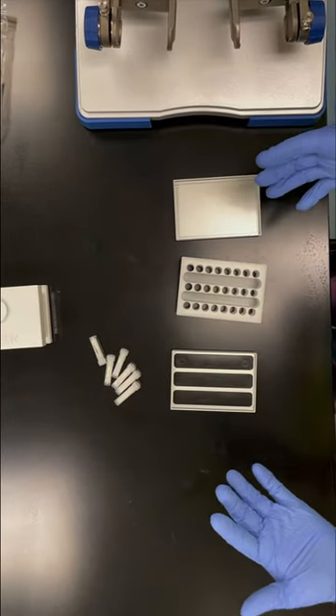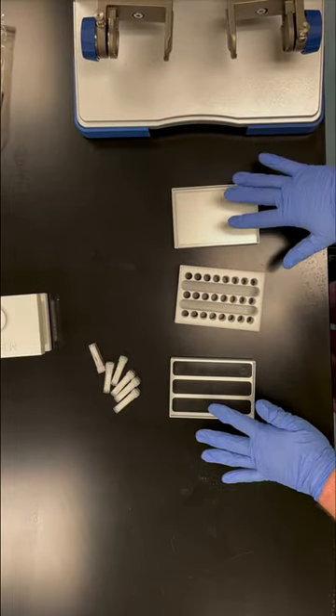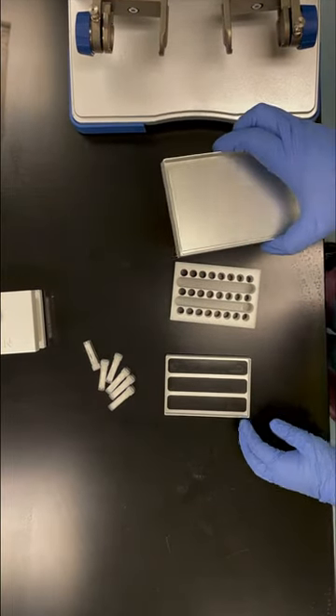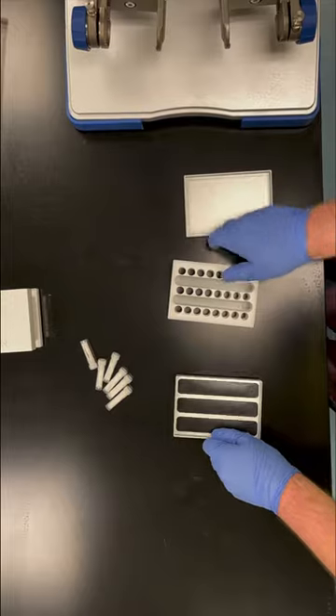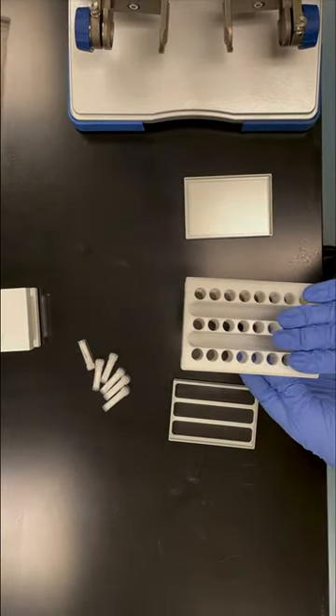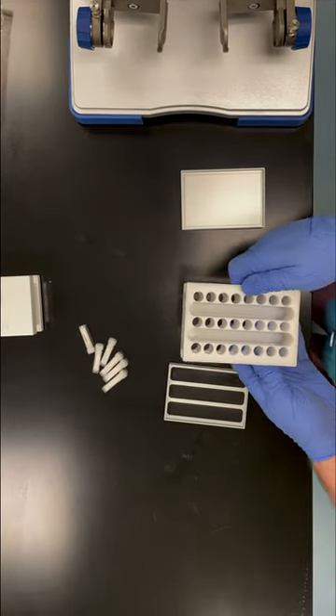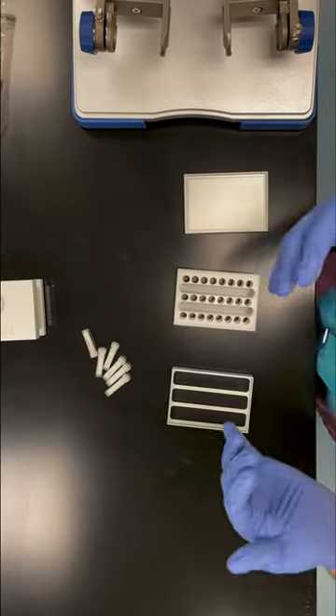In order to set up the TissueLyser 2, we want to start with our blocks deconstructed. We have the bottom plate, the top plate, and then the adapter block that goes on the inside. This is going to hold our 24 tubes — up to 24 tubes. It can hold 2 mL and 1.5 mL tubes.